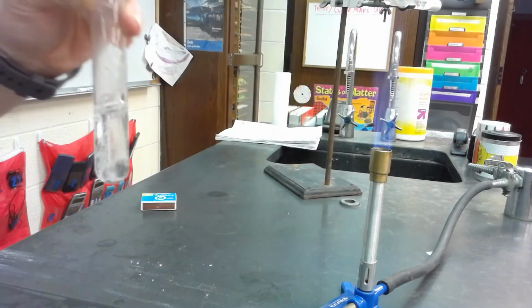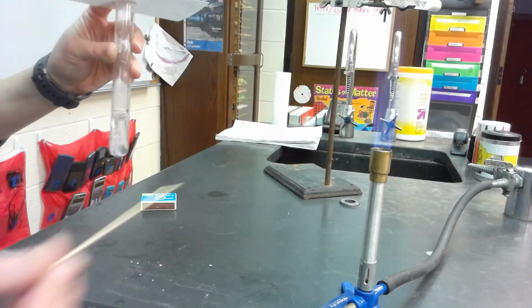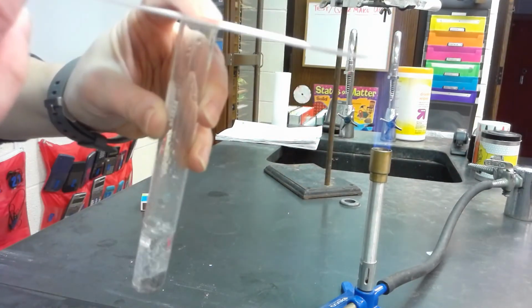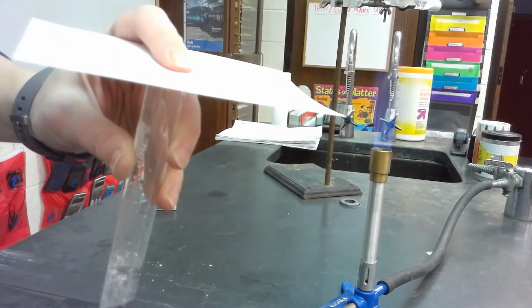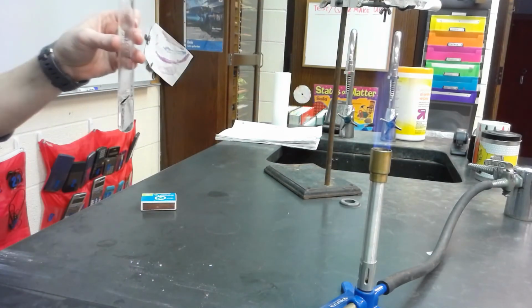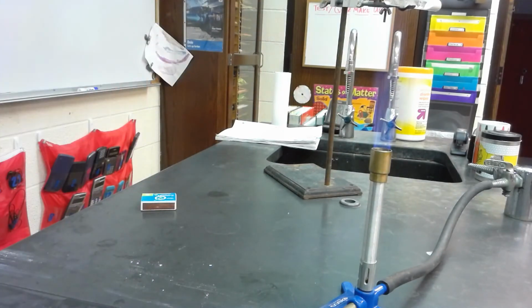All right, let's see if we can make this work. So we need to light the stick, like we did for the last splint test. And then quickly, we're going to take the note card off. We're going to put the stick in and see what happens. Oh, we got a nice little pop there. That is a characteristic of hydrogen gas being produced. When hydrogen gas is exposed to a flame, it makes a nice little pop. Sometimes it's known as a bark. It's called the barking dog when you do it as a demonstration. And that tells you what gas you have.